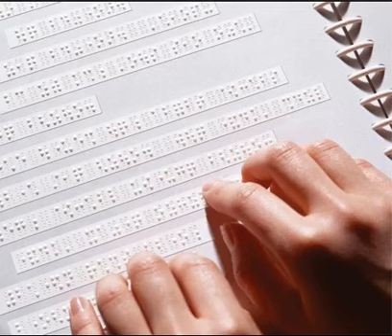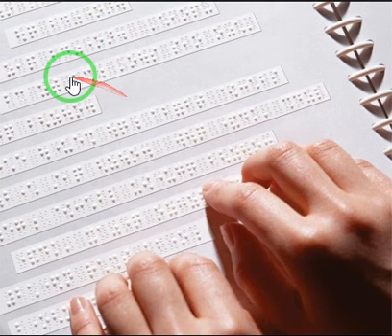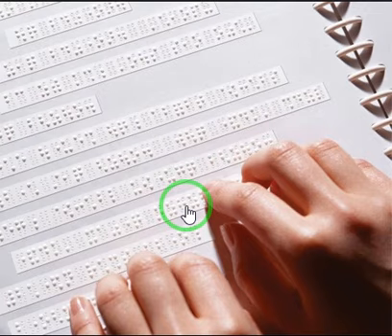Hi everybody. In this video we want to introduce a new imaging technique which does not use the fluorophores and the fluorescence phenomenon. It's somehow similar to the way that blind people can read. They cannot see anything. They just move their fingers on these specific books, and by the feeling they can realize what is exactly written on the book.